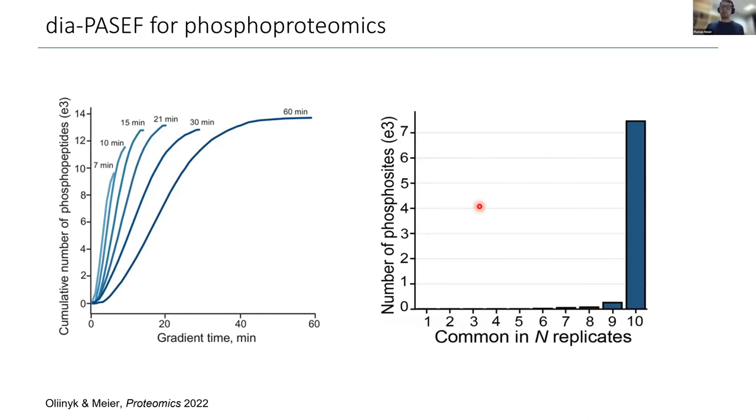And you can either use this for full proteome analysis, or, in one very recent study that we did, it works equally well also for phosphopeptides. And the reason why I'm showing this slide here is because I think it shows very nicely one of the advantages of these data independent acquisition modes. And that is, you can go very fast in your analysis.